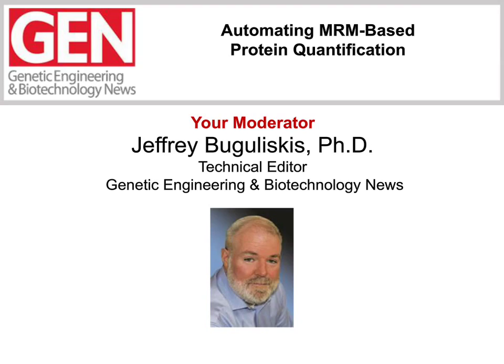Multiple reaction monitoring, or MRM, using mass spectrometry is a highly sensitive method for quantifying protein or peptides in complex biological samples. In contrast to traditional mass spectrometry, which attempts to detect all proteins within a biological sample in an indiscriminate manner, MRM is highly selective and targeted, allowing researchers to calibrate an instrument in order to search for peptides or protein fragments of interest more precisely. This approach allows for greater specificity, sensitivity, speed, and quantitation of analytes.